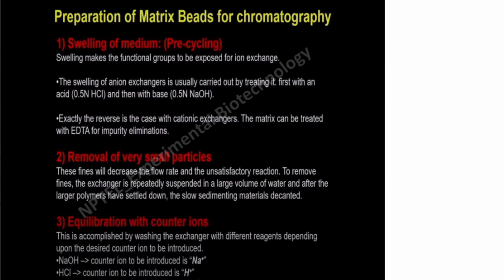Swelling of the medium means, the beads are generally adhered to cellulose or agarose based mediums. I gave you an example of anion exchange, that was DEAE, right?